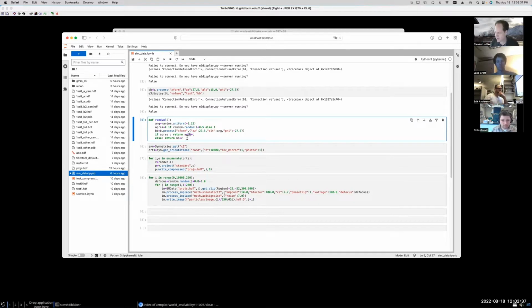So it was producing, we weren't really getting much dynamic data in the data set. So I went to refine it, and I did the GMM on it, and it was like, it's not producing any motion. What's going on? And yeah, that turned out to be the issue. Anyway, so if that's fixed, then you can rerun this, or you can just use the data that I sent around, which was computed.